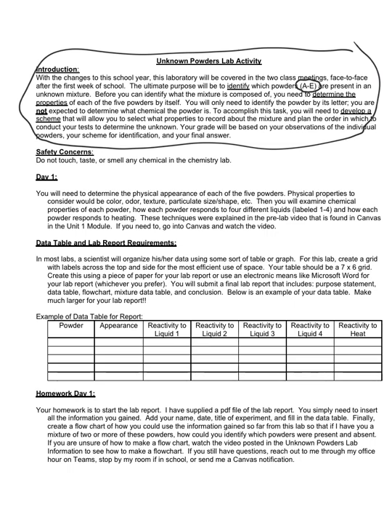Plus, the result of the mixture will not be quite as prominent because not all of the substance is that powder. It is mixed with other things. So what you want to do is identify very unique positive results in your properties that are going to cause you to clearly know when a certain powder is present. Maybe in one of the tests, only one powder turns a specific color. All the other powders do not. So if you even get a lighter shade of that color, you know that powder is present. And this is much like what scientists do.